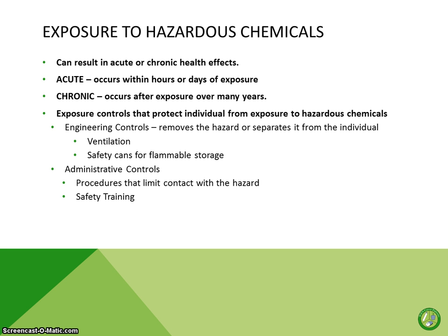We need to be concerned about exposure to hazardous chemicals because exposure to hazardous chemicals can result in acute or chronic health issues. Acute definition is something that occurs within hours or days of exposure. Chronic occurs after exposure over many years, which we won't have in the lab.